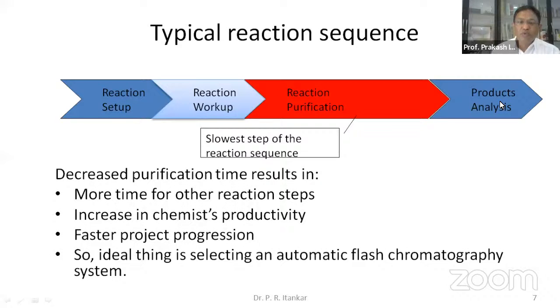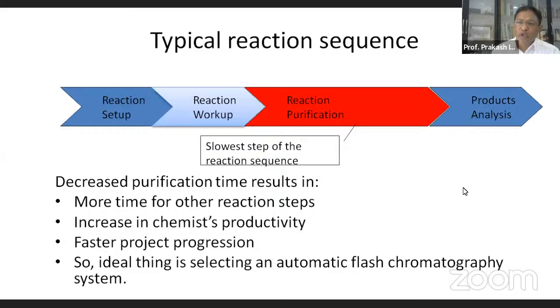Separated form. What you need is the product analysis thereafter. So as we have seen, characterization means you need to have all physical parameters in place, all the data interpretations in place, and therefore we need to have a lot of patience while handling the column chromatography, right from the reaction step to product analysis.